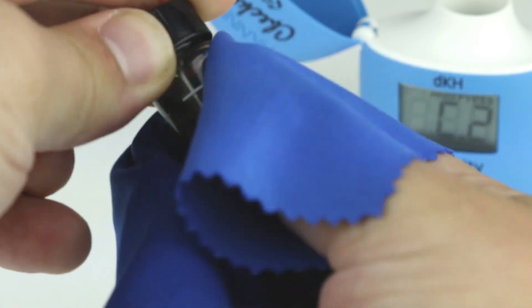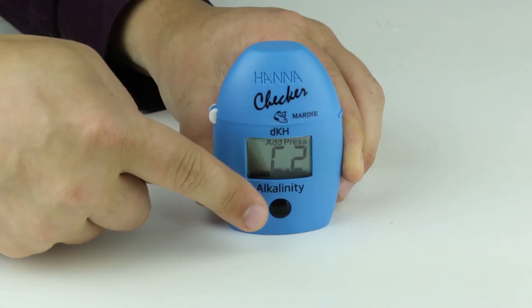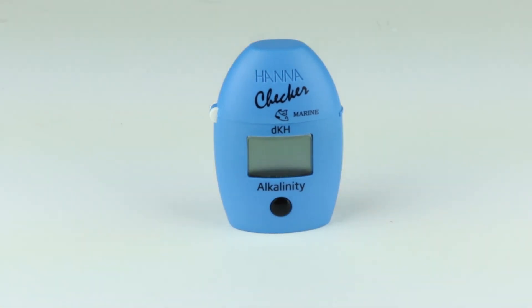Wipe the cuvette of any oils and fingerprints and place back into the meter. Press the button and the meter will display the alkalinity in degrees of carbonate alkalinity.